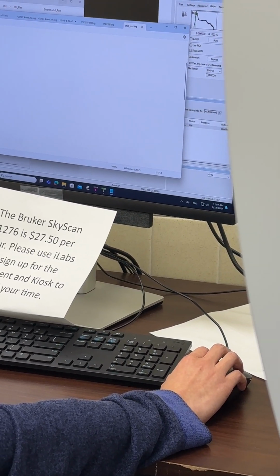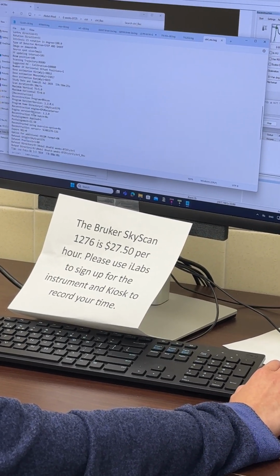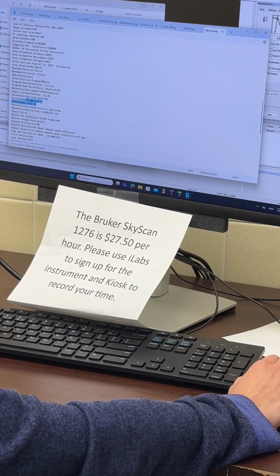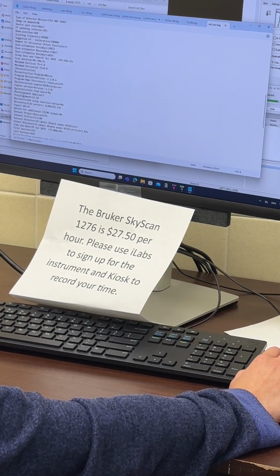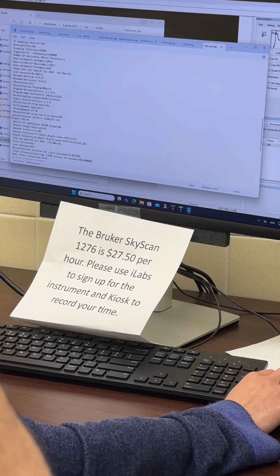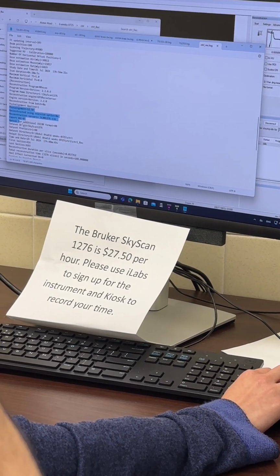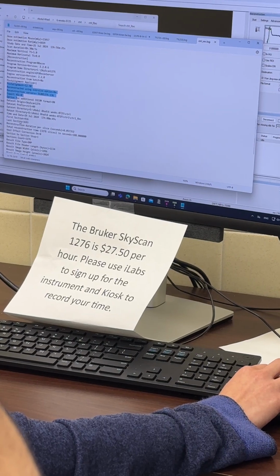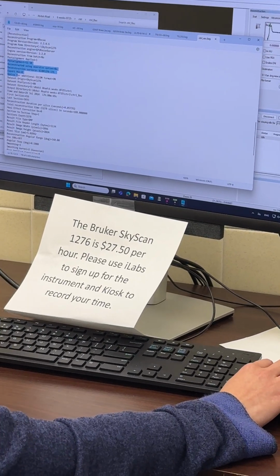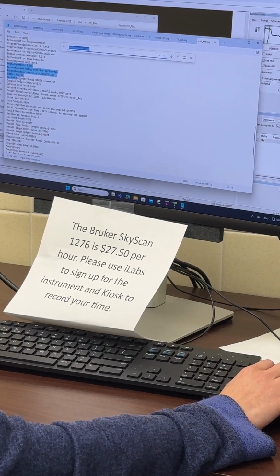No, it doesn't have it. What about the scanning setting? Oh yeah, it has it here. Great. Oh, okay. So all the settings will be saved in the same folder. So if you don't remember which one is which, you can go back to see. This is the alignment, 12.5, and what are the others? There's somewhere we can search, right? I think you can press Control F.